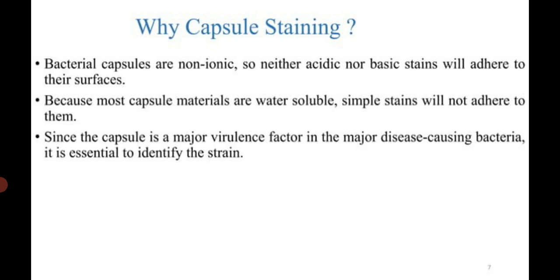5. Capsule staining. We know that the capsules are non-ionic. They don't show any charge on them. So neither acidic nor basic stain will adhere to their surface, because most capsules are water soluble and simple stains will not adhere to them. Since the capsule is a major virulence factor in major disease causing bacteria, it is essential to identify it by using a staining technique.